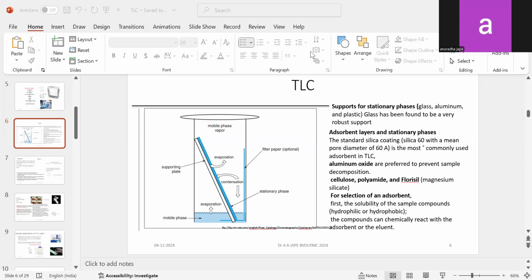If you are using an adsorbent like kieselguhr or alumina to prepare the thin layer of the chromatographic plate, then it is adsorption principle. And if we are using silica gel that holds water, same like your cellulose paper in the paper chromatography, so when a thin layer chromatography is performed by using a thin layer prepared by a substance like silica gel, it works by the partition principle.